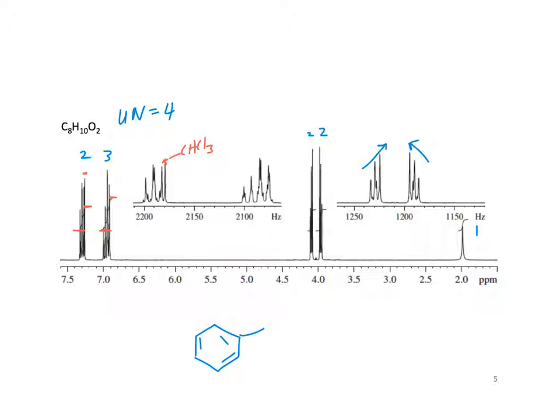So you can see the far right, the 2.0, that proton doesn't show much, does it? So what do you think about that? Yeah, could be an OH. Pretty low for an OH, but in chloroform, I can convince myself of that. There's not much structure at all to it, so that maybe suggests that it could be an OH.